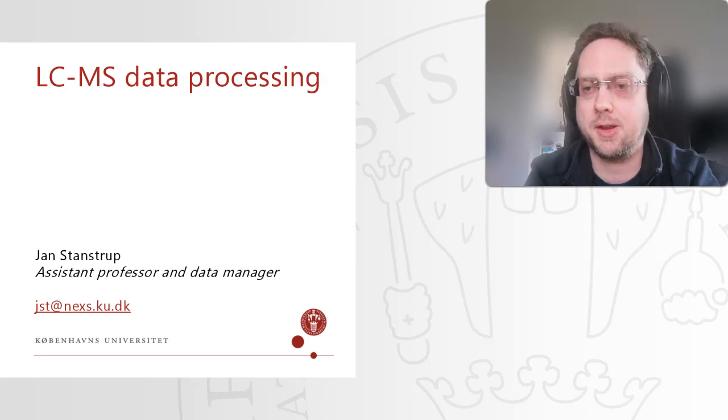In this video, I will give you an introduction to pre-processing of LCMS data. I will explain what the goal is, what some of the challenges are, and give some detail on how it is practically done using the R package XCMS, that is one of the most used tools for pre-processing of LCMS data.